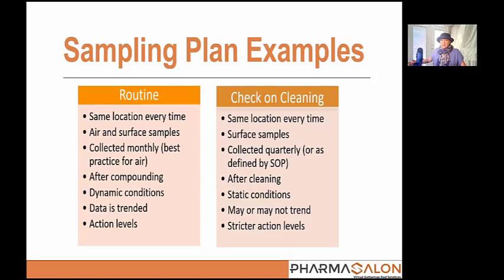What are people supposed to do about the 1 CFU of mold recovery in the ante-room? That's an interesting question, and that will play into some of the things that we'll discuss later through this presentation.